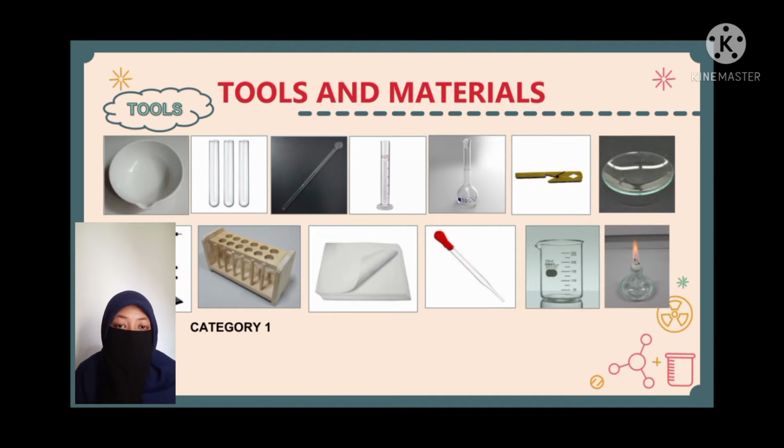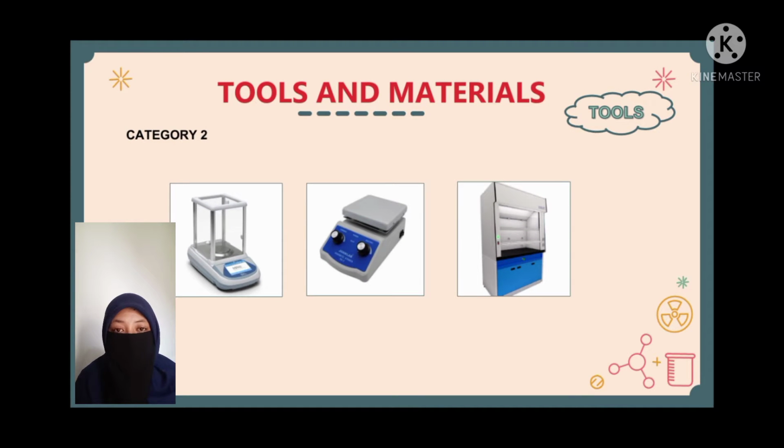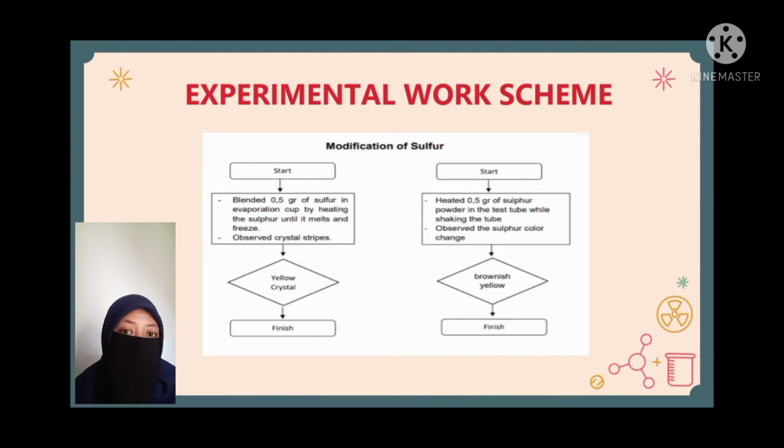Okay, so friends, you can see here the tools and materials that will be used in the practicum. Okay, next, the experimental work scheme: modification of sulfur.